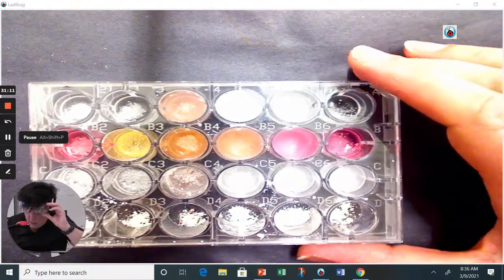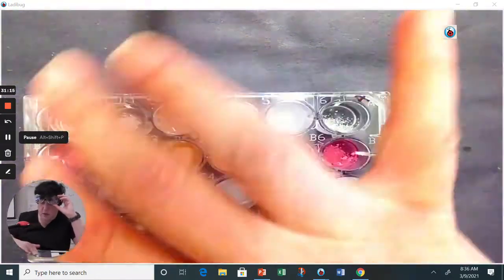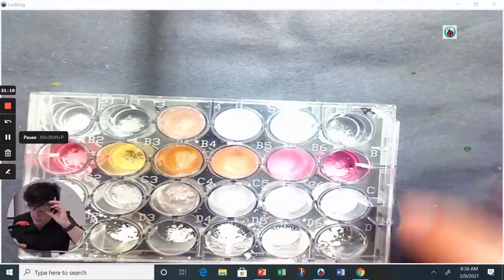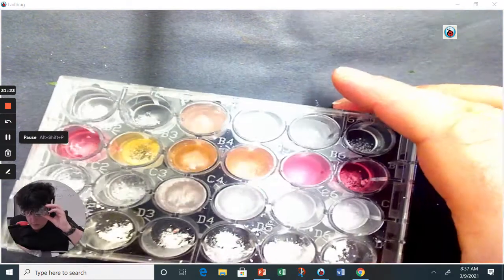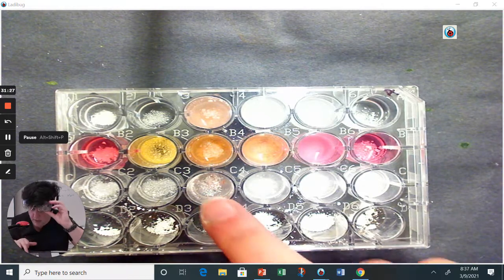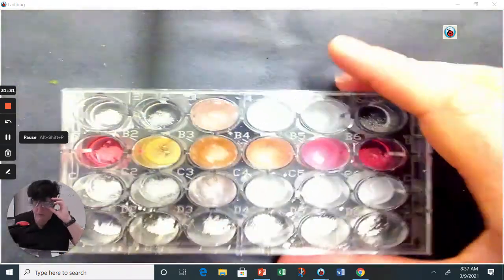So that's not acting how I expected, because the first tests acted a lot like one of the other knowns. So this is kind of different. And that has more of a film on the top. So with the acid, that has a bigger film, and that bubbled. But none of the rest really did anything.